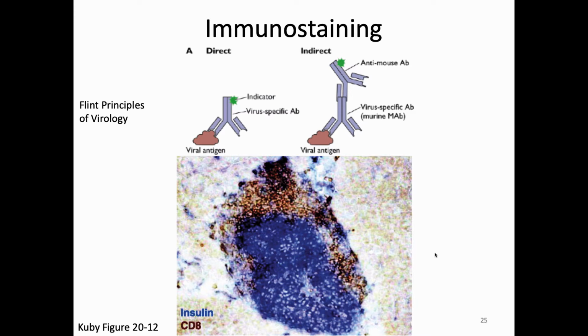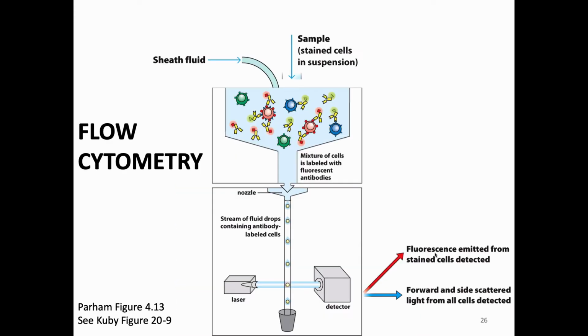And so there is actually a machine that does this in an automated fashion. That is sort of the workhorse of immunologists. And it is something known as a flow cytometer. With your flow cytometer, you take your cells and you first label them with antibodies or whatever fluorescent dyes or fluorescent stuff you want. And then you put them in the machine.